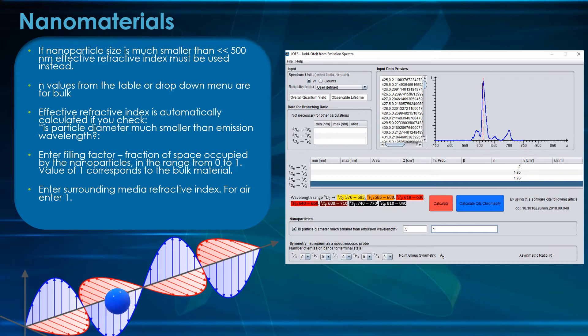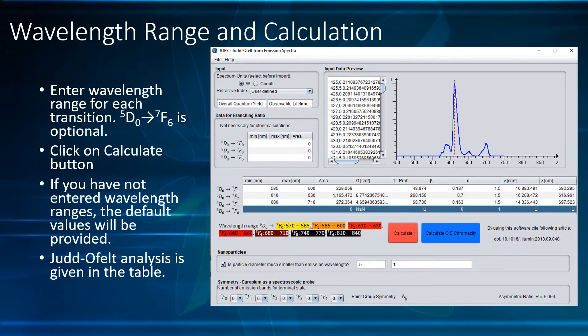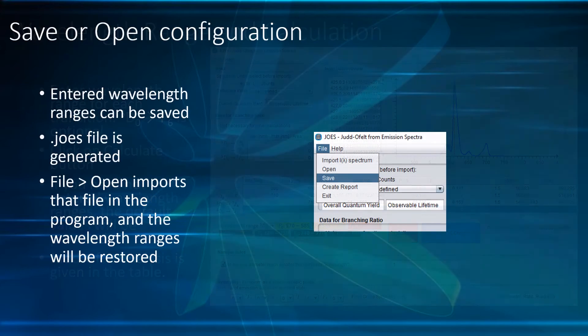Next, enter the wavelength range for each transition. The 7F6 transition is again optional; if you do not enter the value, the default values will be provided. Click on Calculate and in the table the Judd-Ofelt parameters and derived quantities will appear. You can save the wavelength ranges you entered in the table in the JOES file.